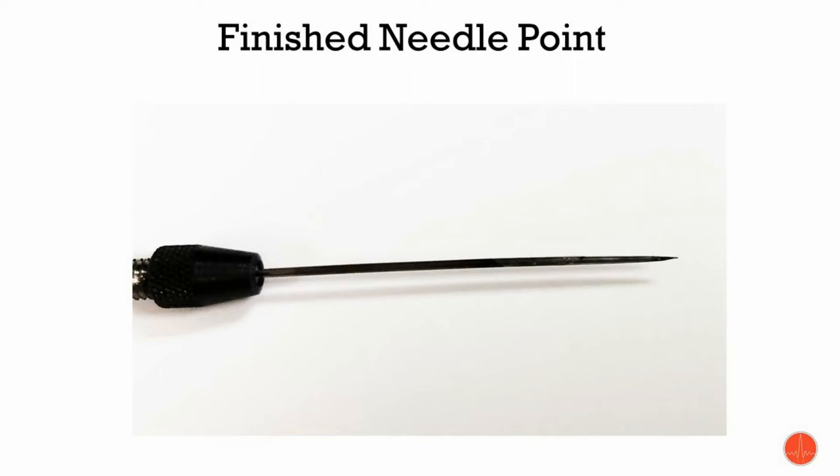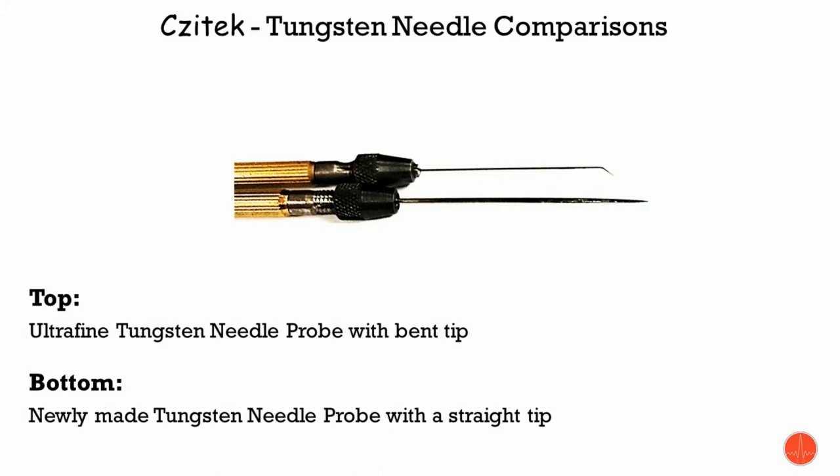Just like to make a quick comparison here in needle tips. On the top you have the ultrafine tungsten needle probe with a bent tip — this is a 0.5 millimeter diameter piece of wire, and the tip diameter is on the order of less than 10 micrometers. As compared to the bottom, which is the tip we just made — this is a 1 millimeter diameter tungsten wire, and the tip is on the order of tens of micrometers.